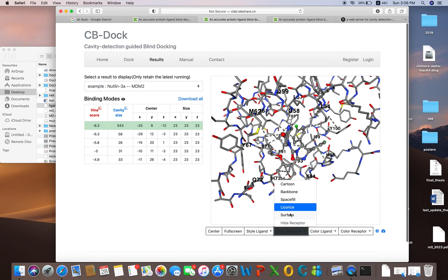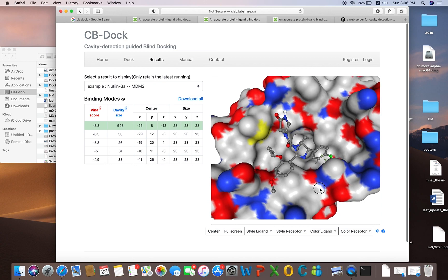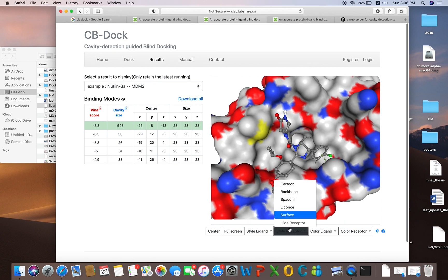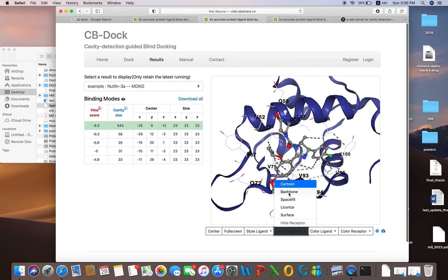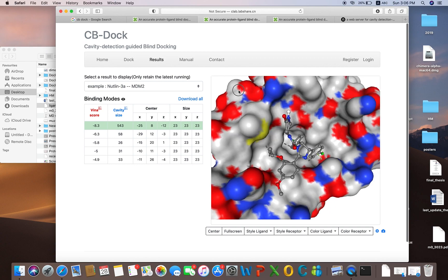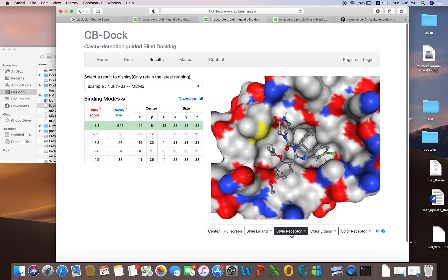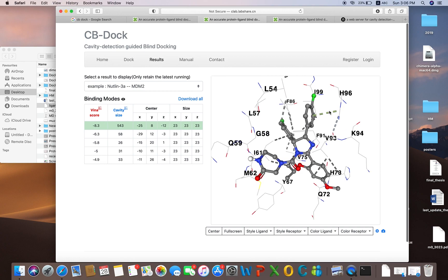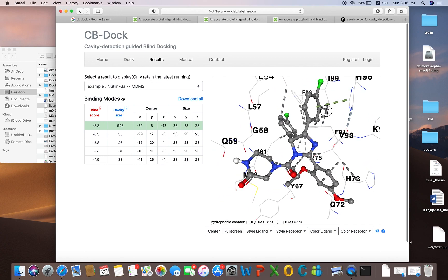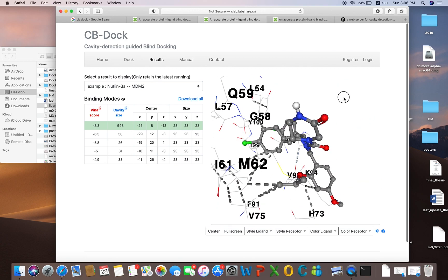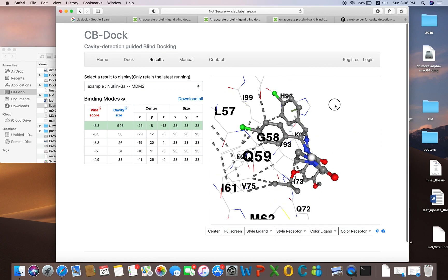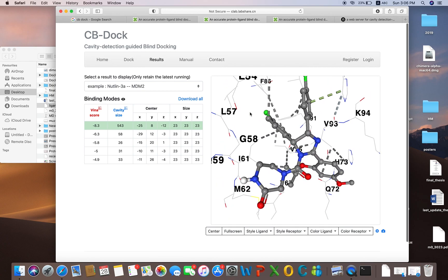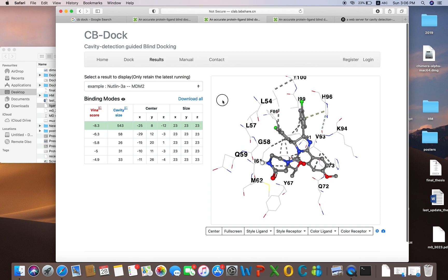The last style is surface — if you want the surface representation it will show like that. If you are interested in only those residues which are important for interaction, you can hide the receptor and these are the interacting residues. In this way you can zoom in and find out which residues are making strong interactions with your ligand and to which sort of atom.